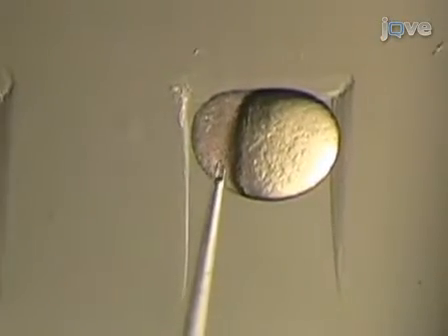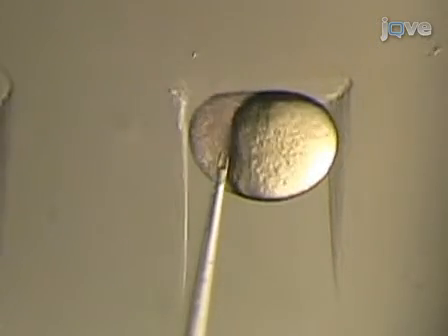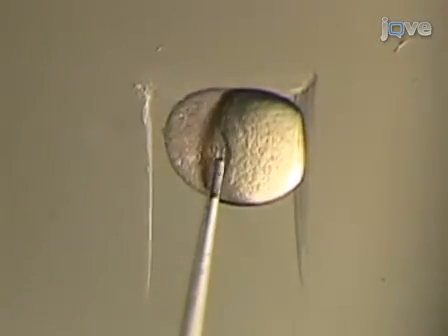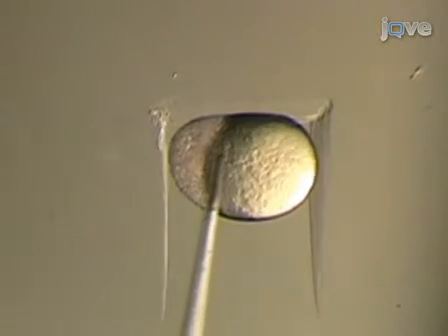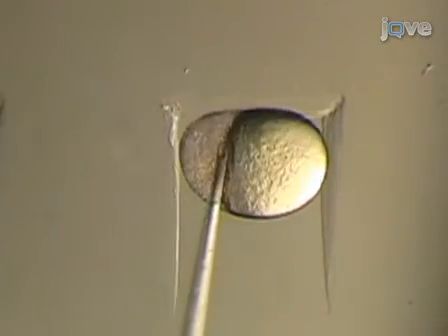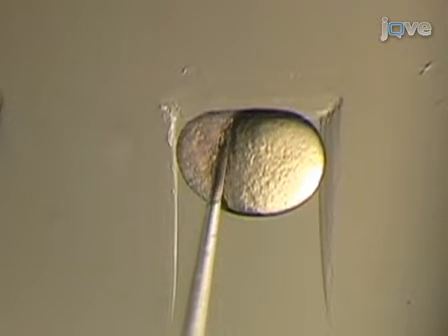That will determine their fate. In the case of primordial germ cells, it's important where they come from in the donor embryo because their fate is already determined. If the goal is to transplant primordial germ cells, then the cells need to be picked up from the margin of the donor embryo. And they are situated right near the margin of the embryo in 4 little clusters of each of 3 or 4 cells at this sphere stage or high stage of development.